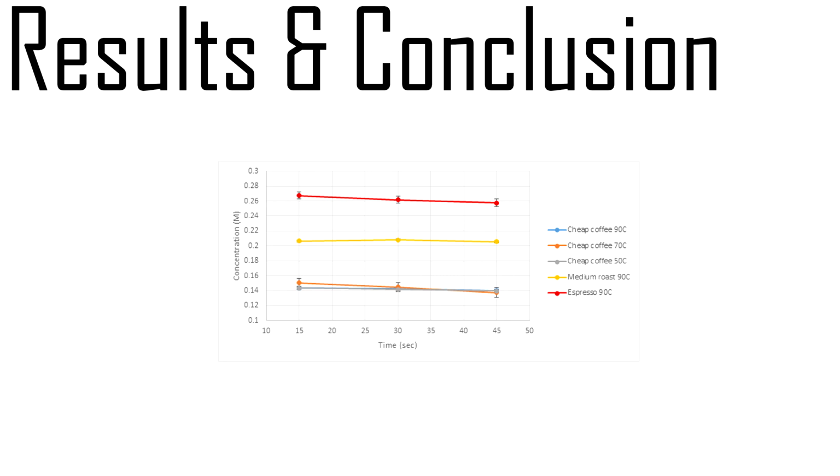Unfortunately, our second variable tested, which was sort of already mentioned, being temperature, was completely inconclusive, as the increase in temperature did not yield an increase in caffeine extraction or a higher extraction at the beginning trial and lower at the later trials. It was just completely inconclusive, as all the trials overlapped and there was no correlation between anything.